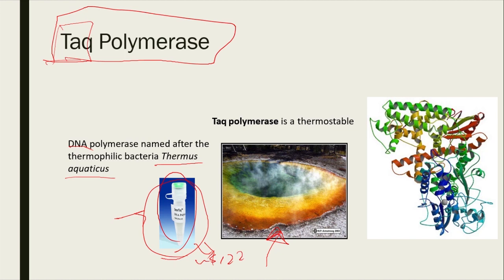Okay, so it's quite expensive, and this particular one can do about 100 reactions or so. So it's not a lot, and typically my weekly usage is many reactions. So if I were to use something that I need to buy every time, I'm going to run out of money very quickly.